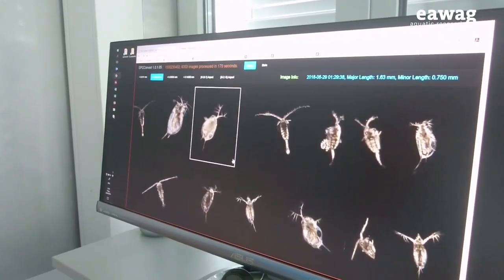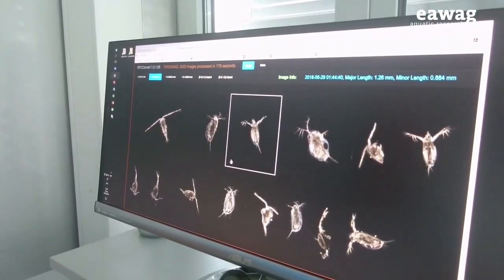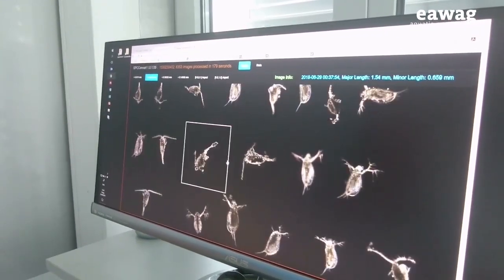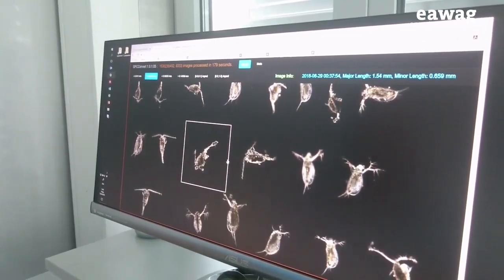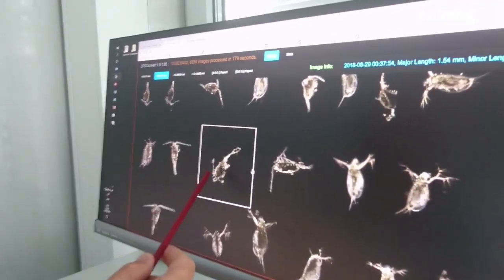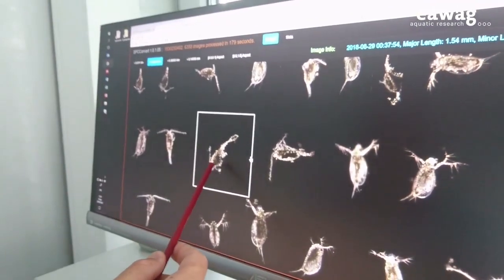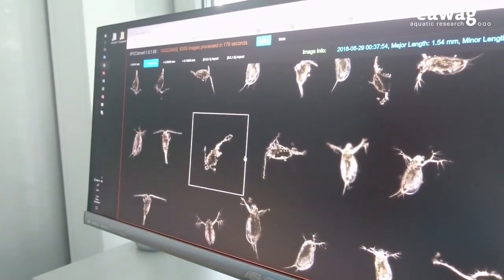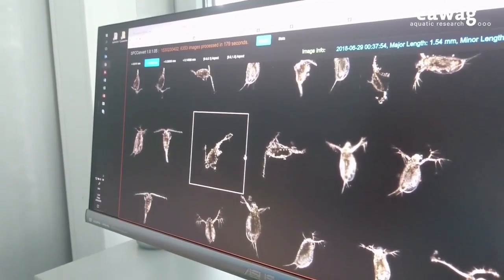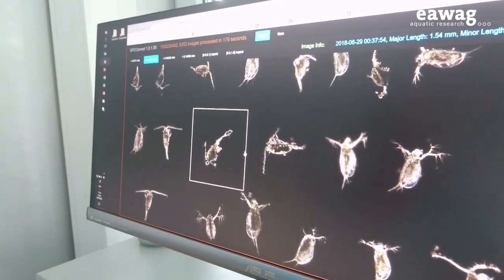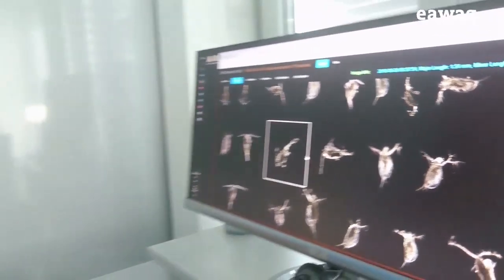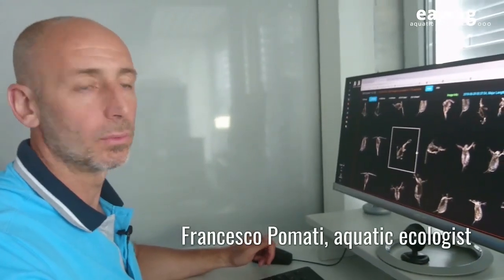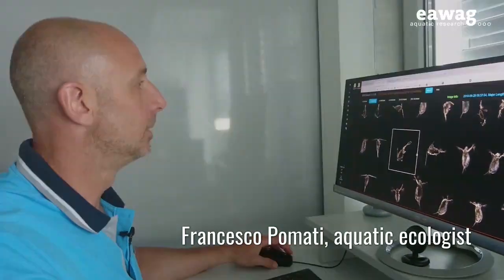One thing that we can already start noticing is that in many instances we can image individual copepods that have other organisms growing on their body. This type of species interaction is generally lost when we sample with traditional methods for plankton.